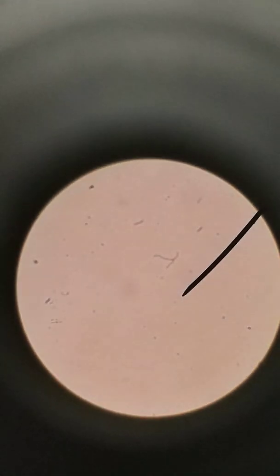One more type of anemia that I'd like to show you. This one is also because of a deficiency, because of a vitamin B deficiency, B12, I believe, if I'm not mistaken. Again, we're going to go to 1000x. Let me center it. Let the oil settle in too. There we go. Perfect. Okay.